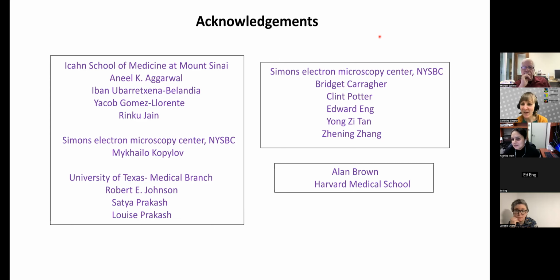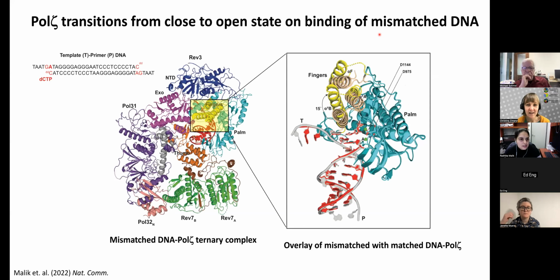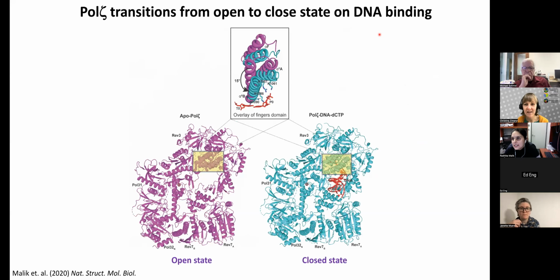There's another question about tilting. For the higher angled tilts, what was the total dose? Was it much higher than for a non-tilted data set? Yes, for the tilting, I didn't mention that here, but we used around 80 electrons per angstrom squared. So we did increase it quite a bit.